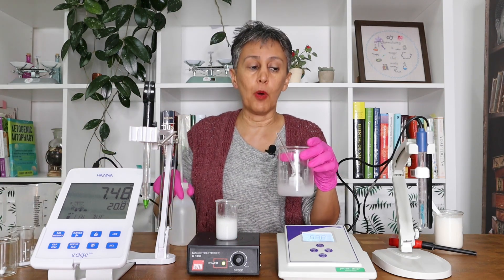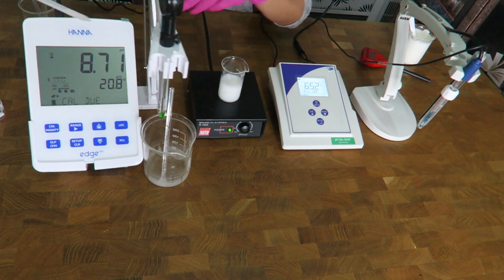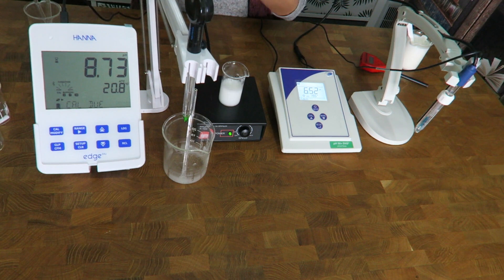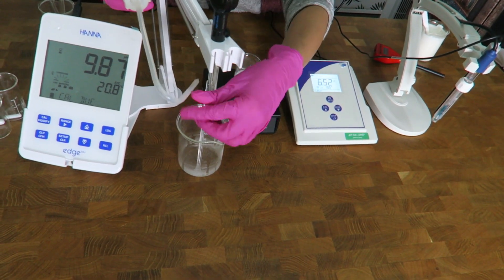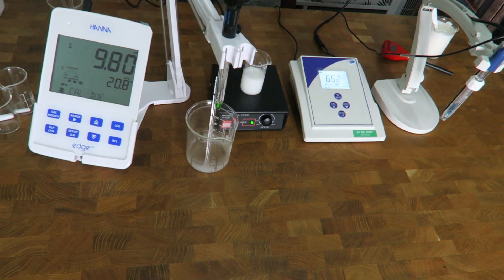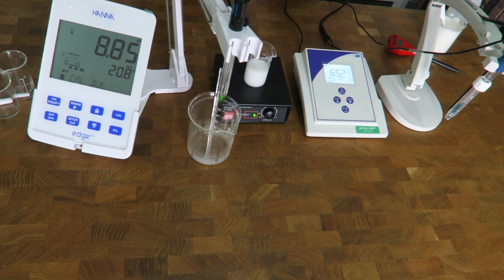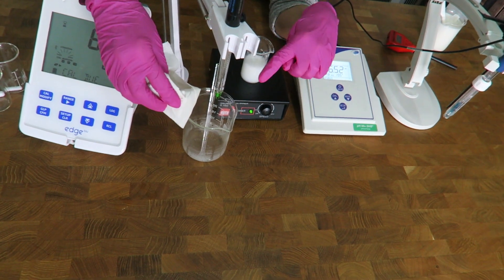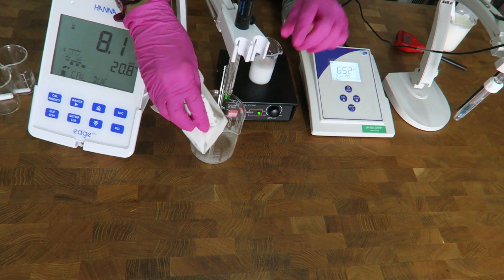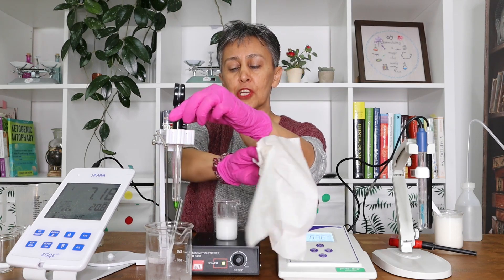When you are rinsing your electrode, go over the electrode with distilled water from all sides and all angles. Then gently take a piece of soft tissue and gently dab it to remove the excess water. Do not rub the electrode — it is sensitive, like the nose of a baby. Just dab the additional water off.